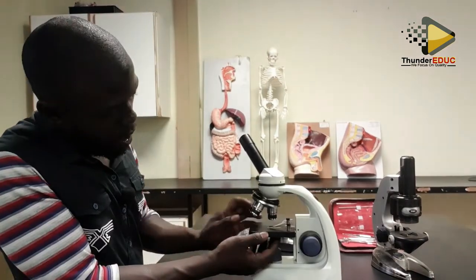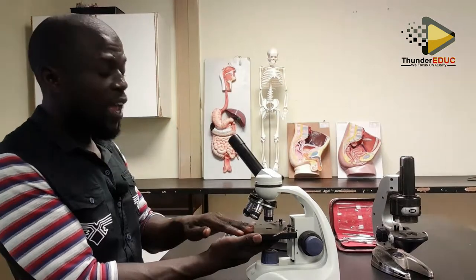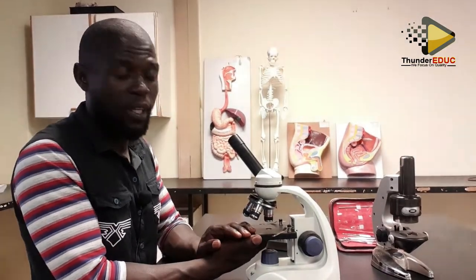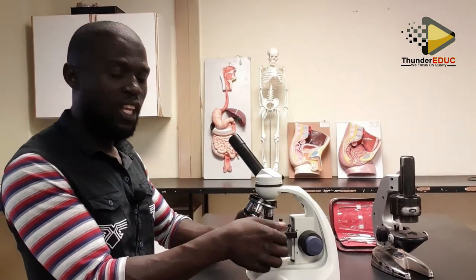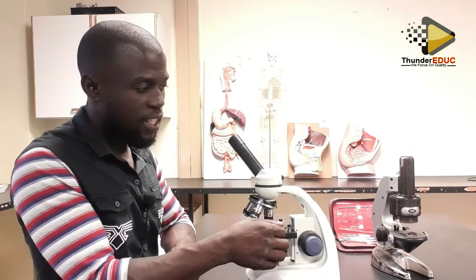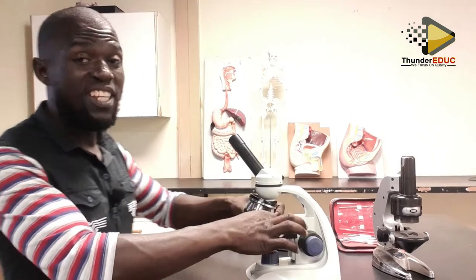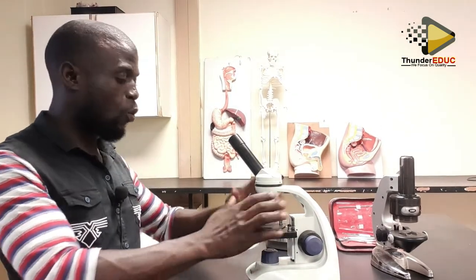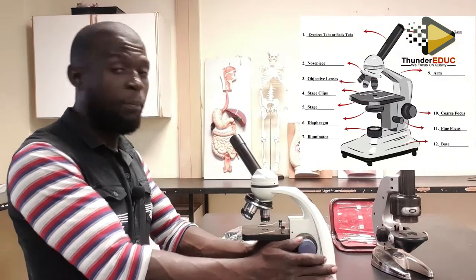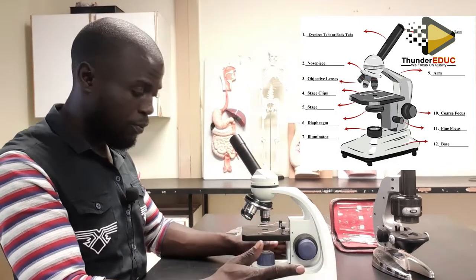All right. It has this part. We call this part a stage, where you put your slide. If you want to view something, you put your slide here. Then it has these things called clips. These are the clips which hold the slide in position. So you put the slide here and then you put the clip on it, so that if you shift a bit, the slide doesn't fall down.